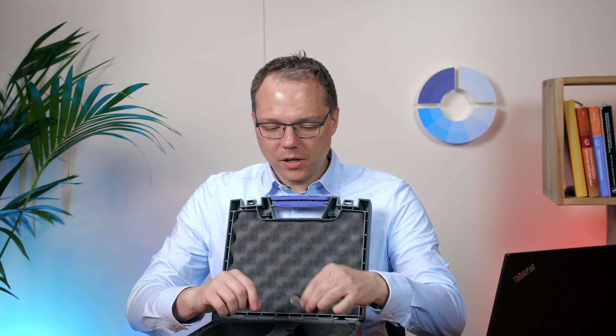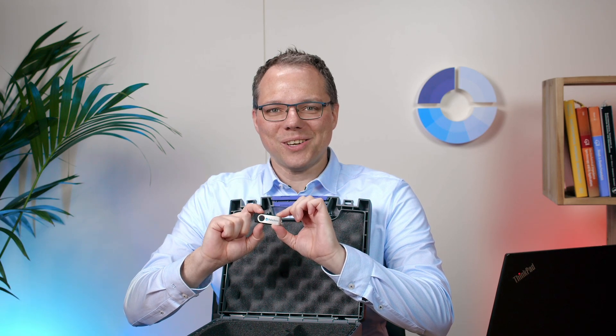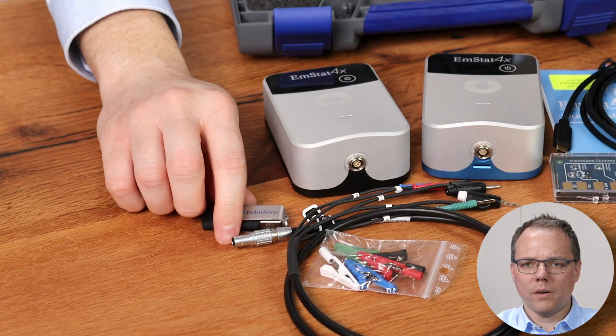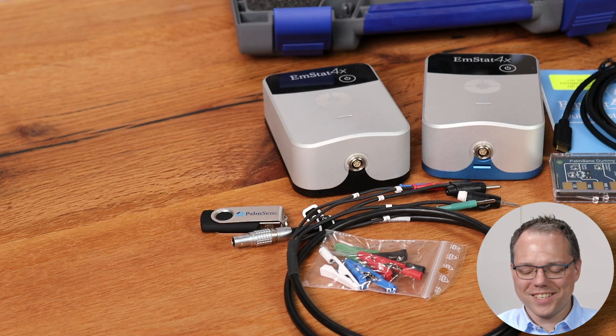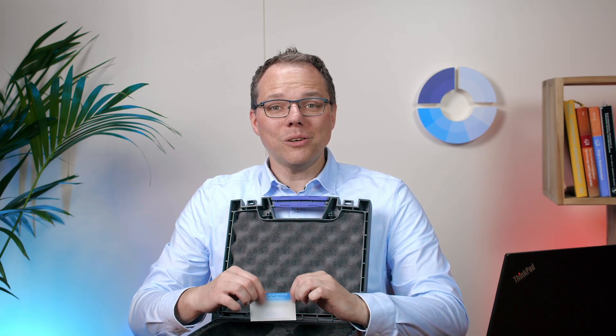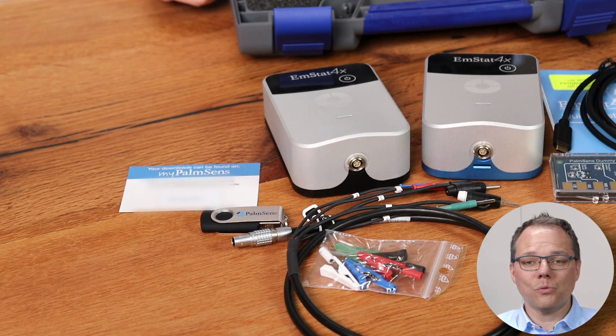We also have a USB stick with our software PS Trace on it, so you can easily install it directly. But if you find that a bit old-fashioned, don't worry — there's also an activation code included that you can use to open an account on our download website so you can download the software.